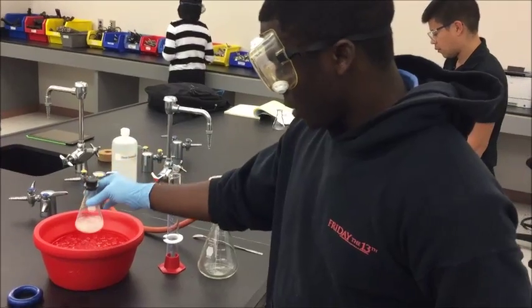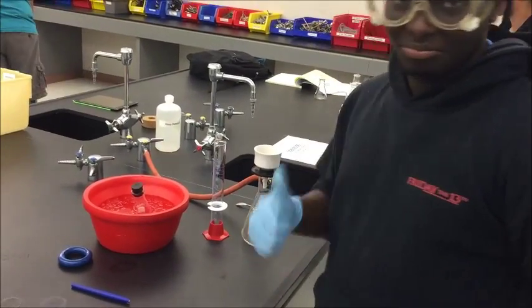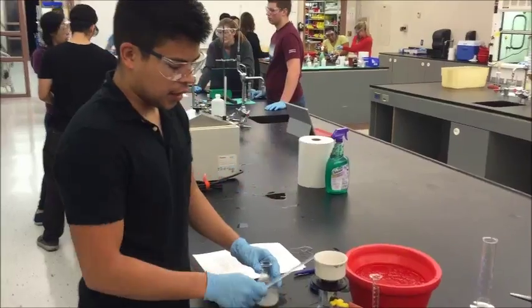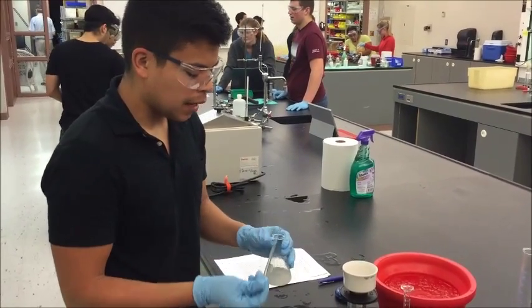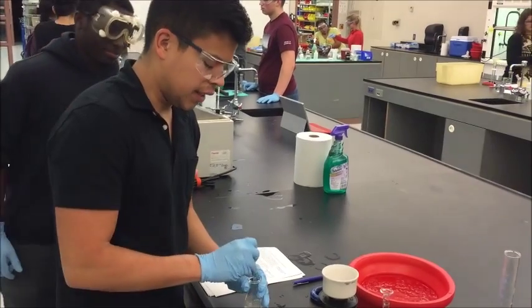Transfer the reaction mixture into an ice water bath and let it cool down until a solid has formed. In the ice bath, use a glass stirring rod to break up the solid and evenly distribute it.